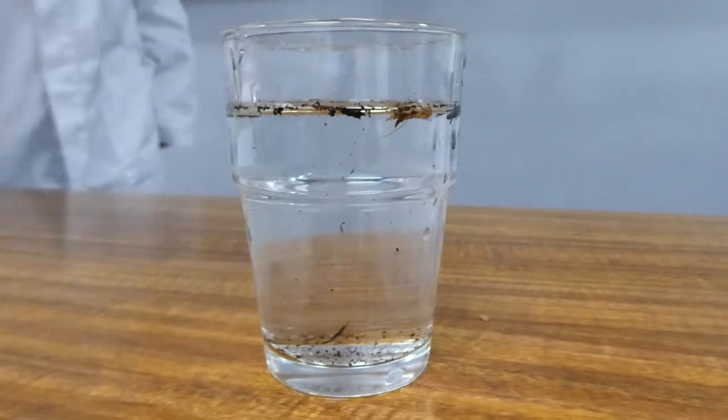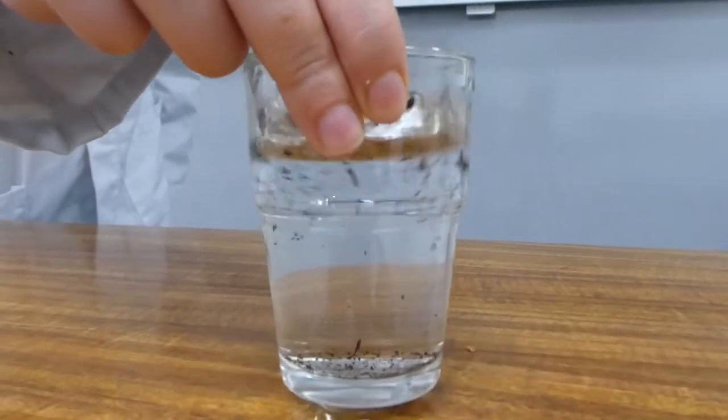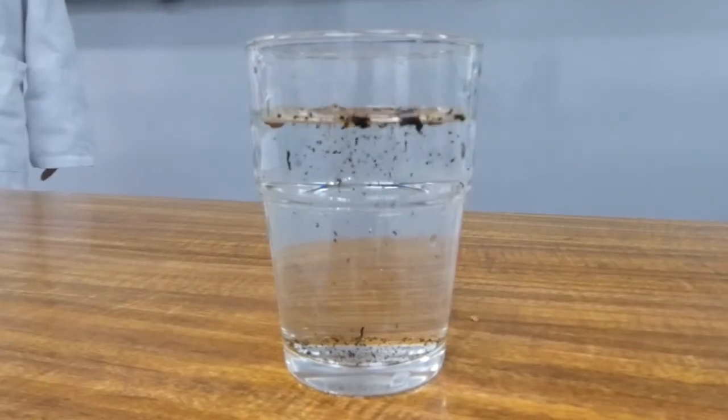Today we are here to discuss two separate analytical methods that can be used to determine the magnesium concentration in our lake water samples. Choosing an analytical method to determine the concentration of metal cations in water samples can be difficult, as earth metals will usually be in the milligram range and trace elements will be in the microgram range.